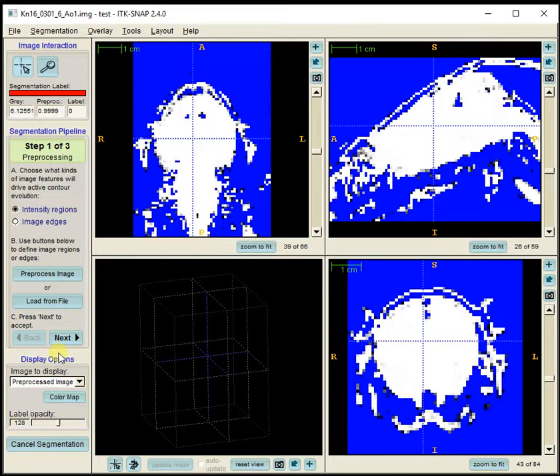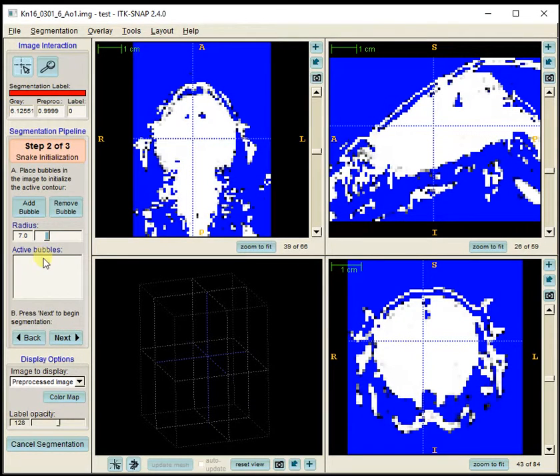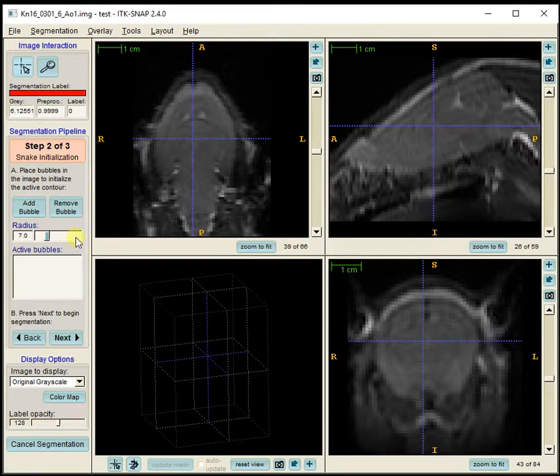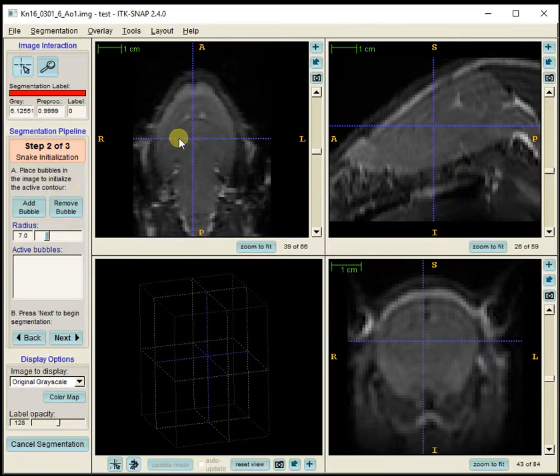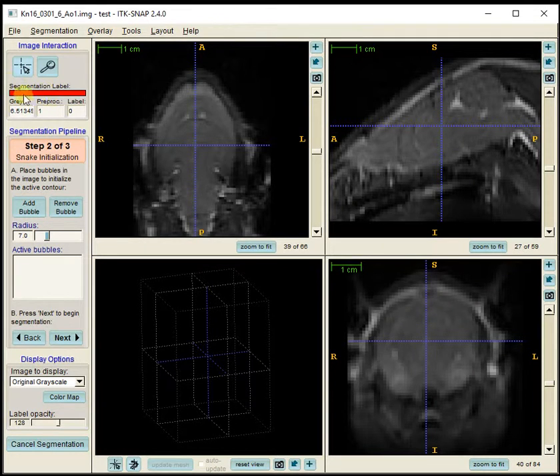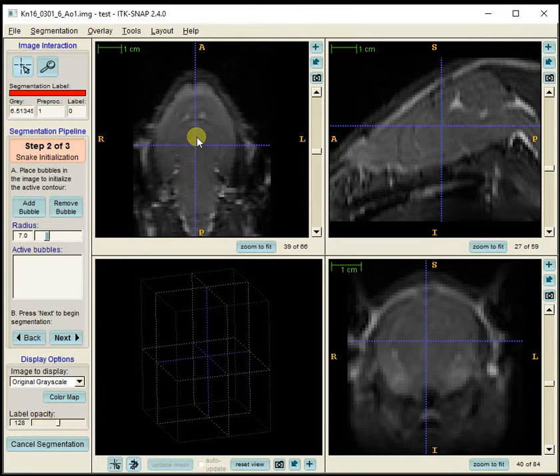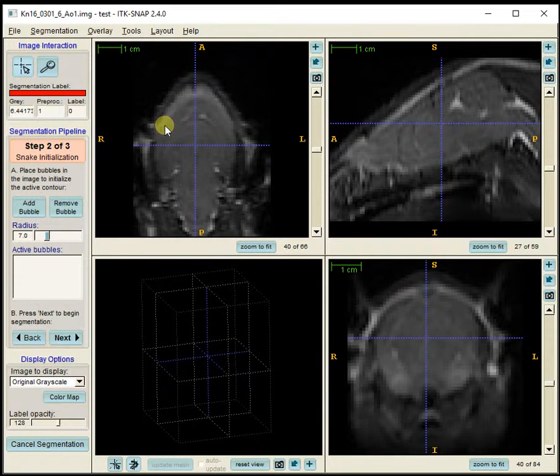Step 2 is snake initialization. I like to change the image display to show the original image at this stage. I'm going to drop seed points — ITK-SNAP refers to them as bubbles — at each place where I want the snake segmentation to begin, giving it several seed points to start the snake growing algorithm. I typically use a radius of five for the brain.